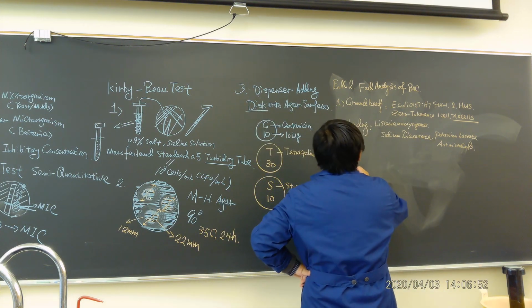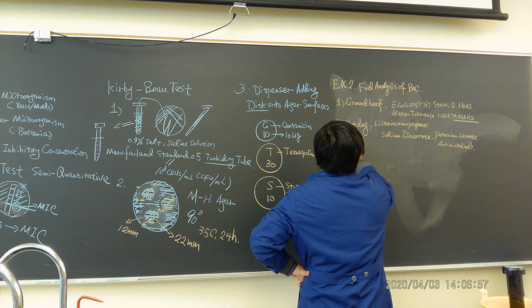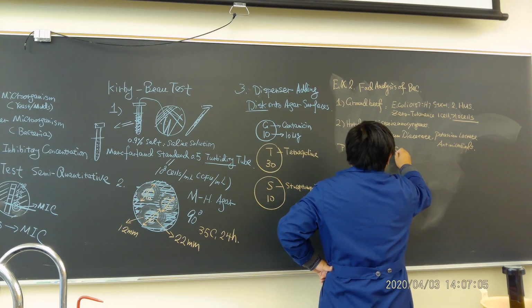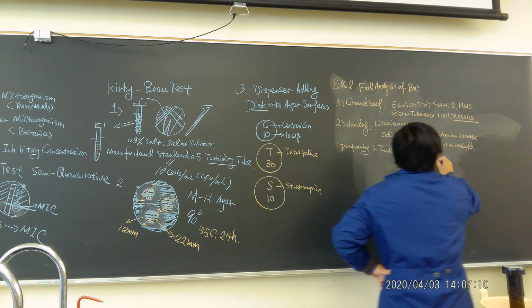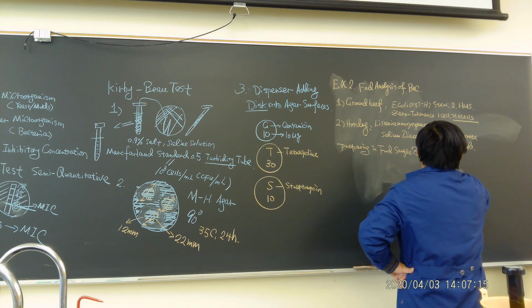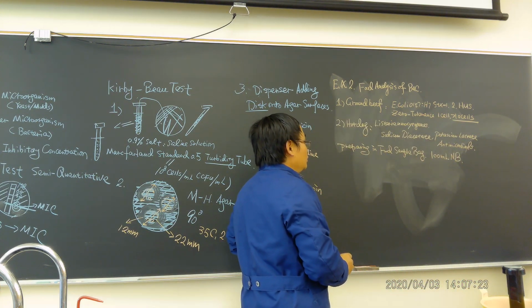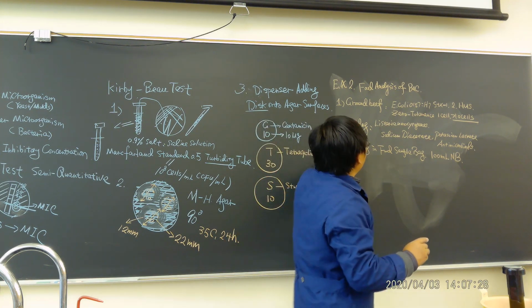The steps are very simple. We're going to do the food preparation. So we're going to be preparing the food in a sample bag. Basically, we're going to add 100 ml nutrient broth in there. Then for different food products, we do it differently. For you guys, we will be doing these 2.